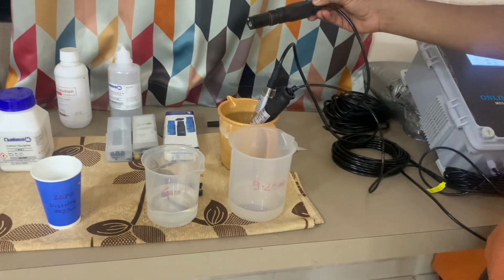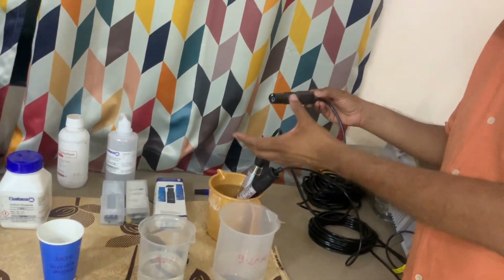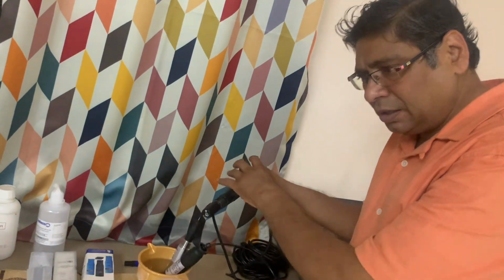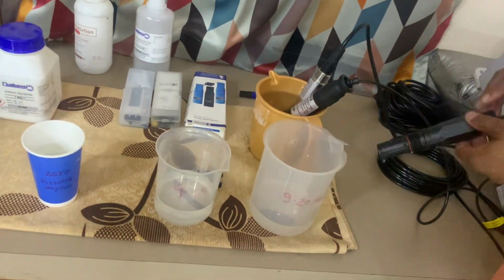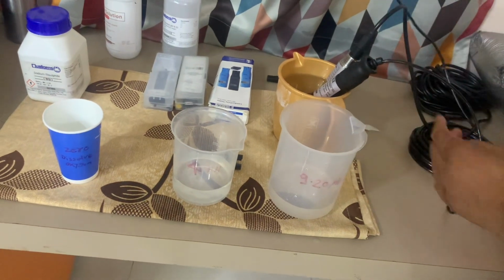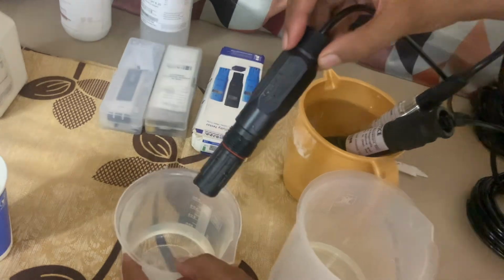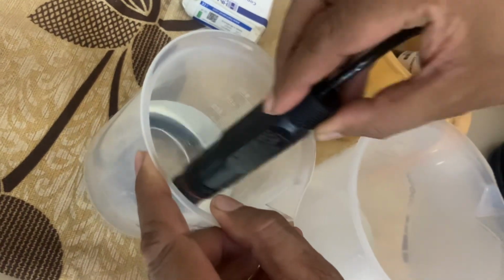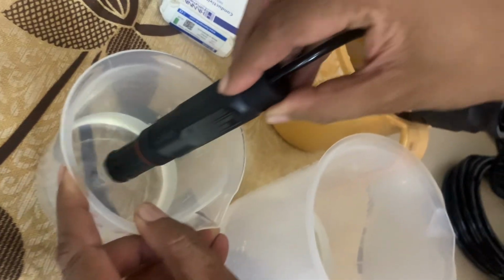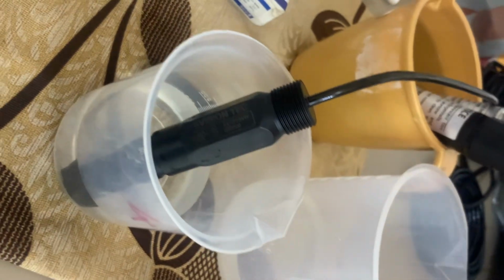Actually, whenever you take it, you have to wash it with the DM water or distilled water, and by some cloth or something, you have to clean it and put. Today I don't have, so I am doing like this, but it's not a standard practice. You need to follow a standard practice when you are working in the industry. Now I'm putting it here, dip it to the tip, no need to fill full, but the tip should be dipped.